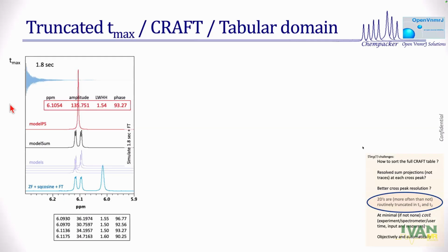So I went back again. I started taking baby steps. I went back to my prednisone example and said, okay, here is my prednisone example. How does truncated FID challenge me in this one particular problem? How does truncated FID change things, or how much do I need to give up resolution? That's the fundamental question. Is there a balance? What is the balance in there?